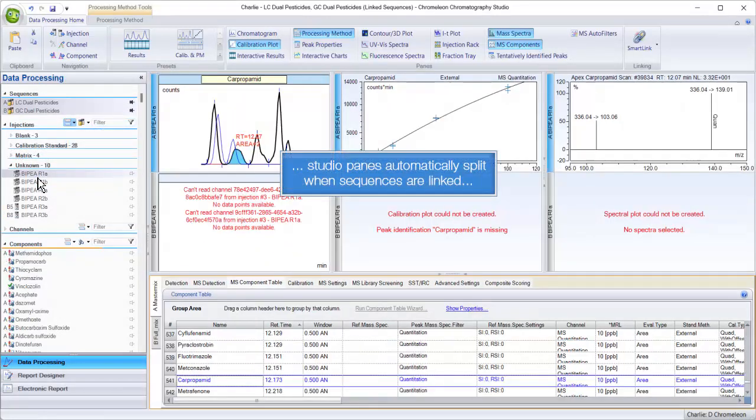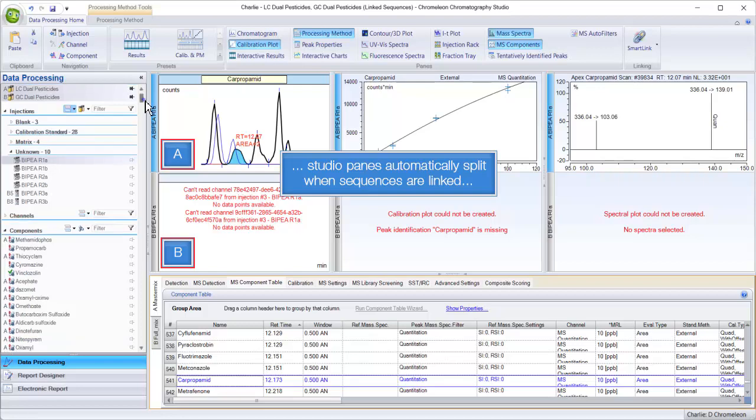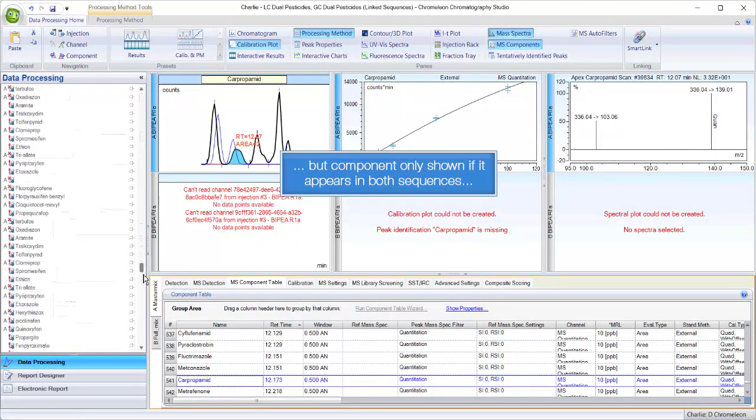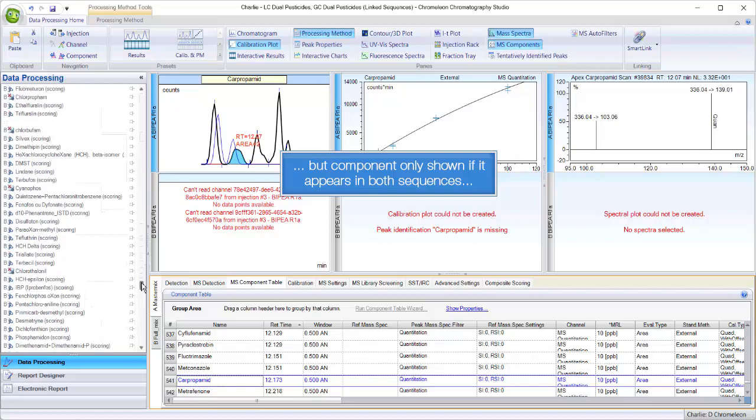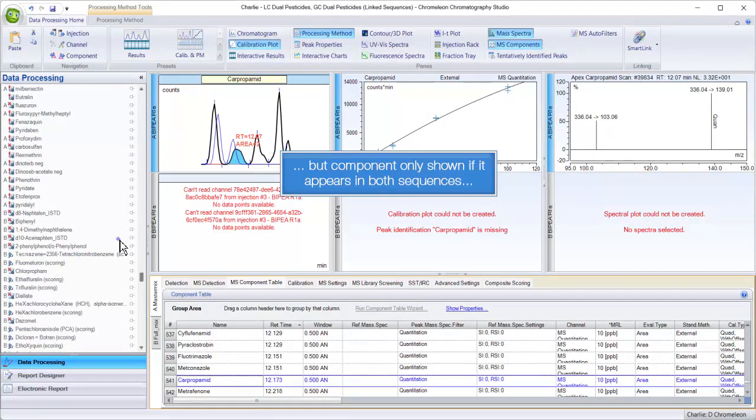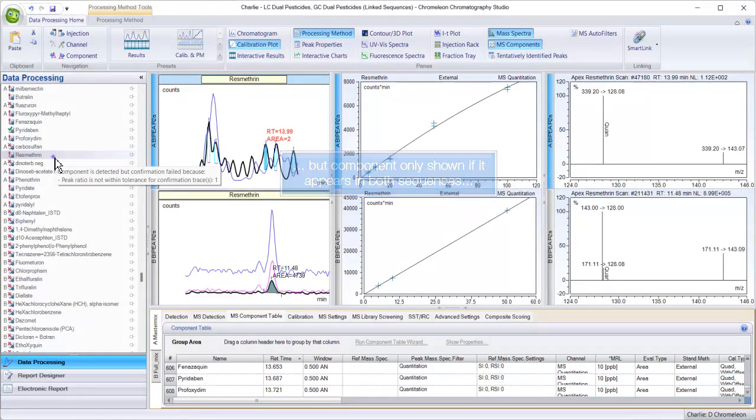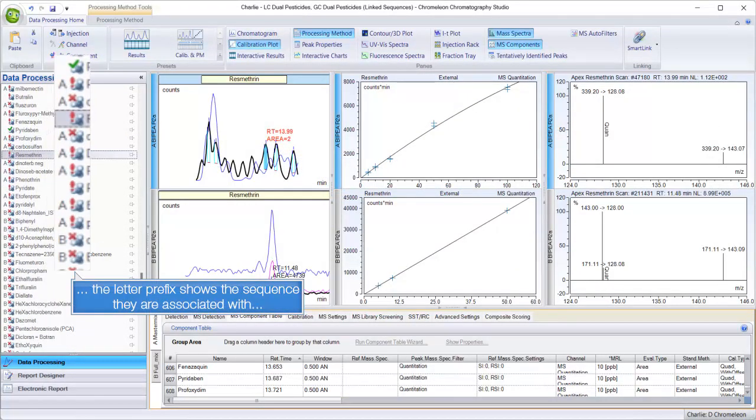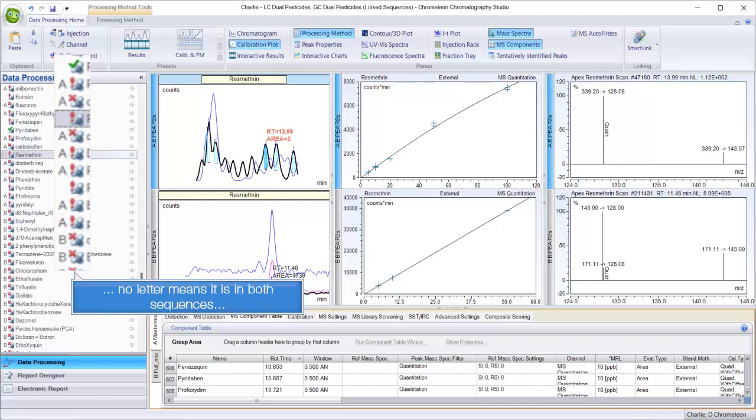Studio panes automatically split when sequences are linked. The component only shown if it appears in both sequences. The letter prefix shows the sequence they are associated with; no letter means it is in both sequences.